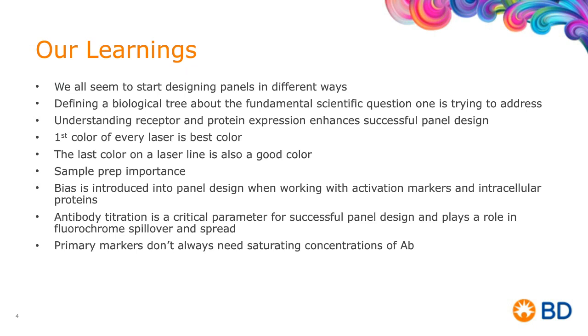We also know that a real foundation of understanding of receptor and protein expression enhances the success of a panel. And the question there is, where do we get all of that information? And today I'm going to share with you one published site and one that is new to be published in the mouse world, because we haven't forgotten the importance of all the mouse experiments, and we've never had some of the data that you're going to see today.